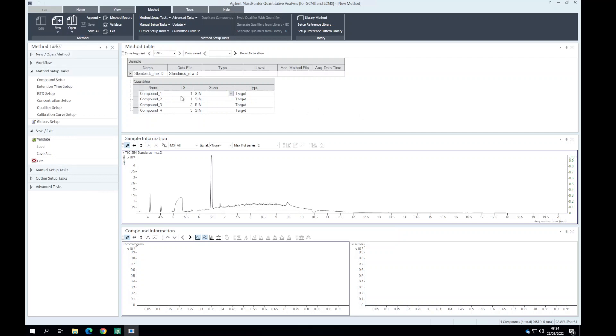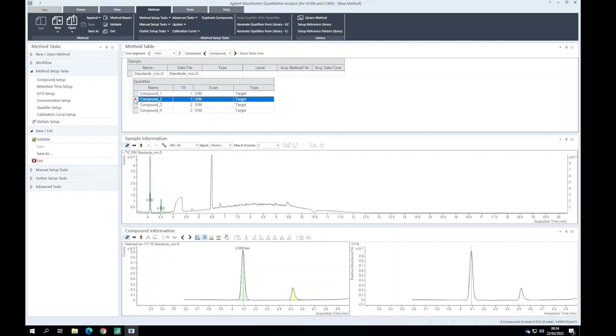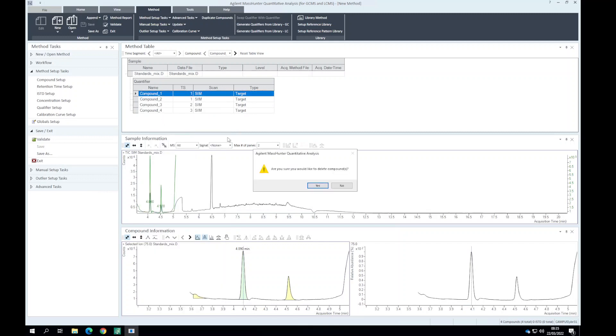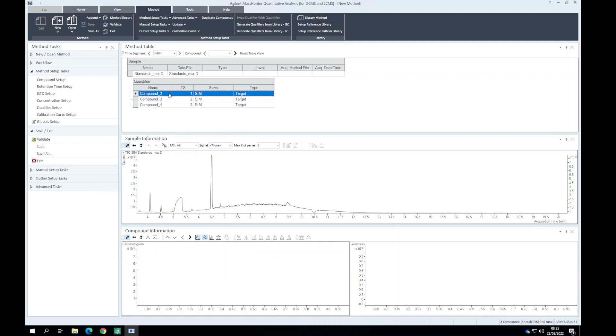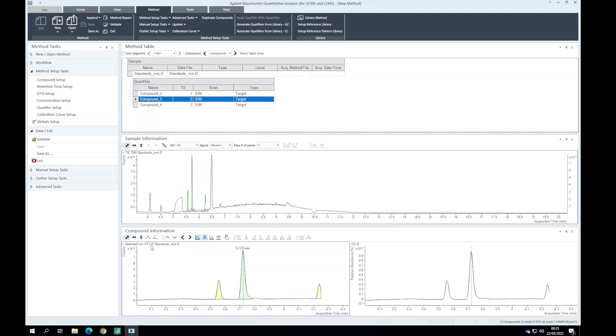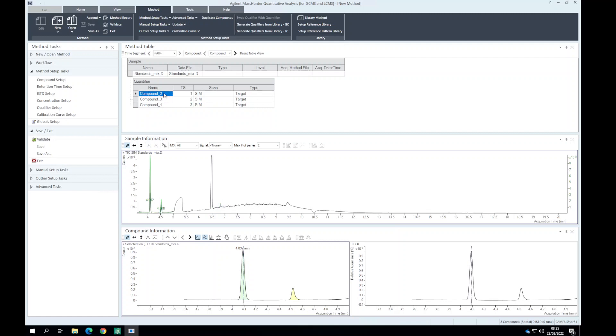Looking at these, for compound one we know our quantifier ion is 117 for acetic acid. I'm going to remove this compound and then make sure we've got simdata for 117 which is our quantifier for acetic acid, 131 which is for propionic acid, and then 145 for butyric acid.